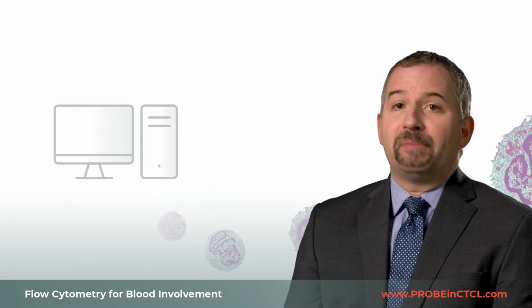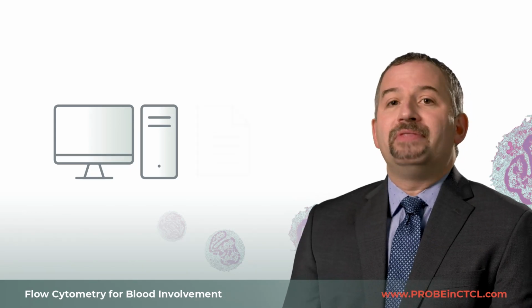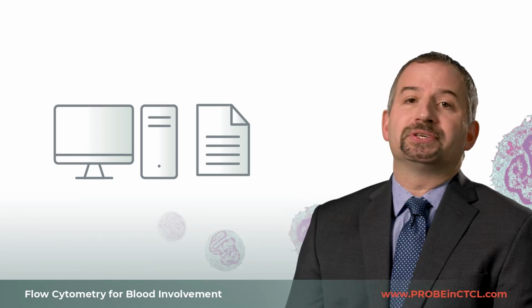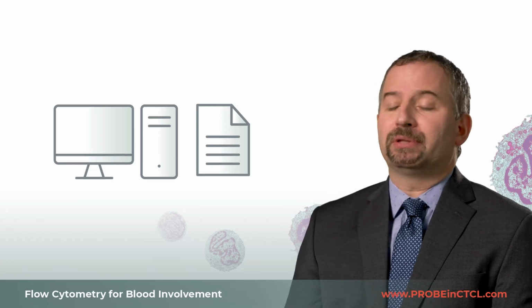This light scatter information is collected and processed by a computer. And then the computer-generated output provides the basis for diagnosis. The report contains data on abnormal T-cell populations.